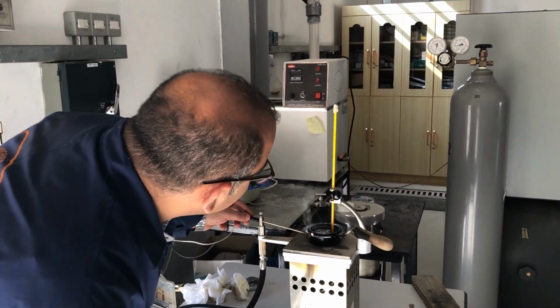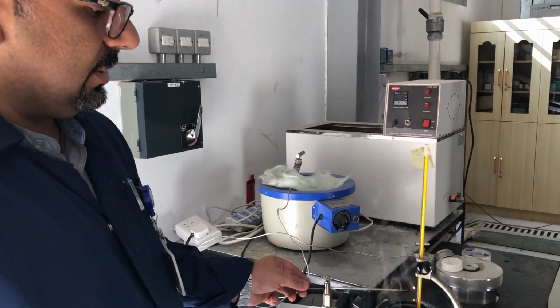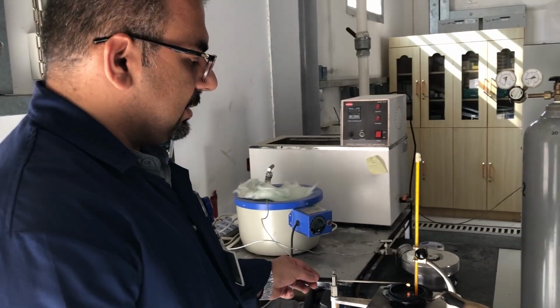The temperature is 310, and still 310, but still no fire point.